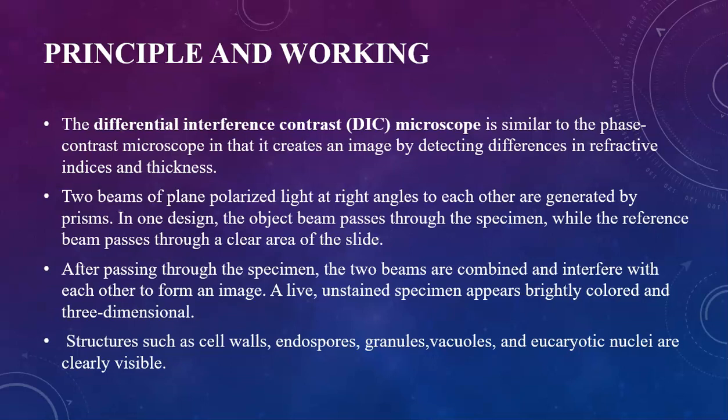So now, taking for granted that you all have seen the video on the phase contrast microscope, we shall now move on to the use of differential interference contrast. The basic principle is very much similar to the phase contrast microscope, and here it is based upon creating an image by detecting the differences in the refractive indices and thickness.